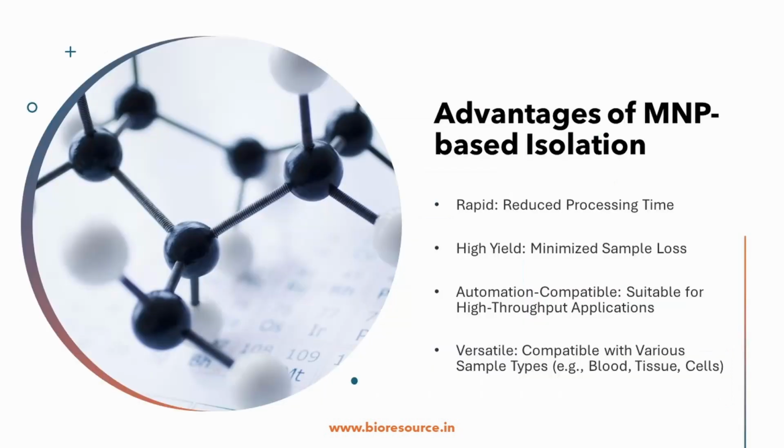So let's look at the advantages of using magnetic nanoparticle based nucleic acid isolation. The magnetic nanoparticle based nucleic acid isolation offers several advantages over the traditional methods. We have seen in the beginning what the traditional methods are which we use for nucleic acid isolation, but magnetic nanoparticles offer some advantages over them.